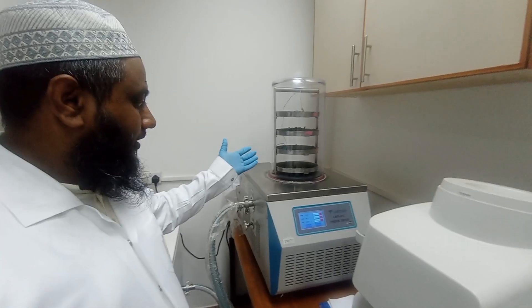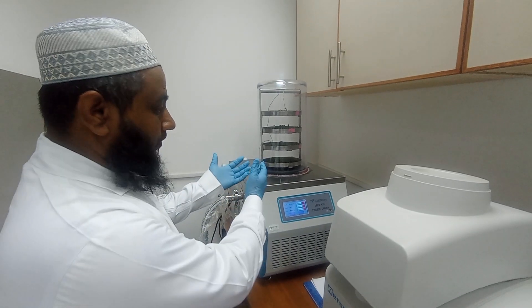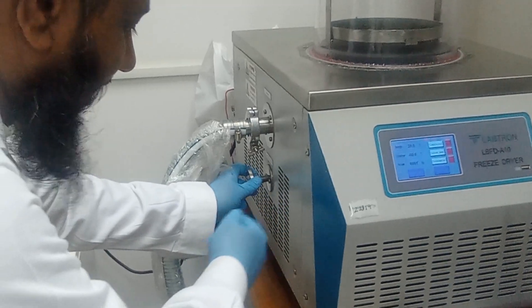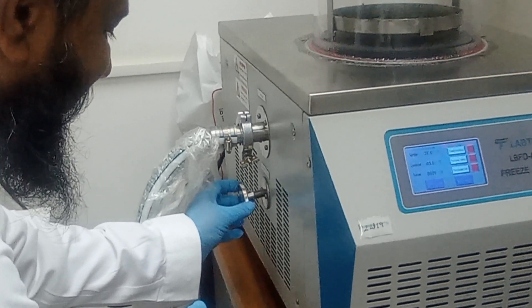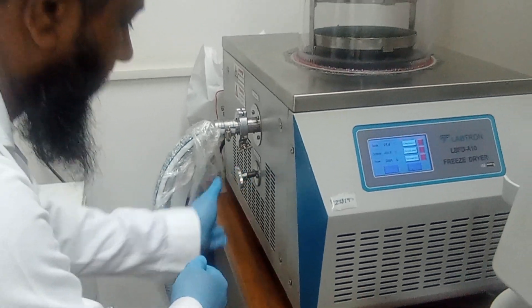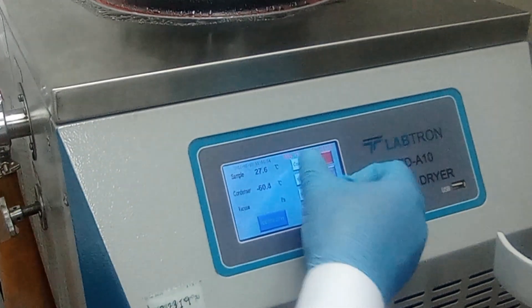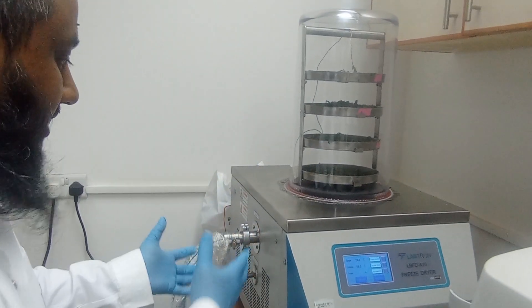After 72 hours of freeze drying, I am going to take my sample out of the freeze dryer and make it into powder. Before taking the sample from the freeze-dryer tray, I first have to open the drain valve so that the gas can be released gradually. Then I turn off the vacuum pump, then the compressor, and wait until complete removal of the gas from the freeze-dryer machine.